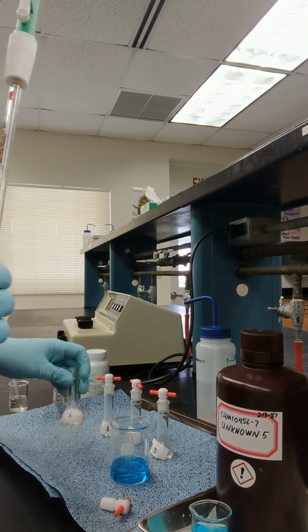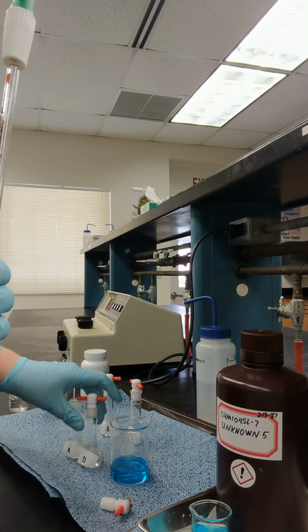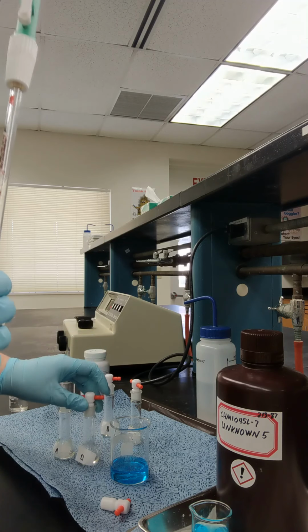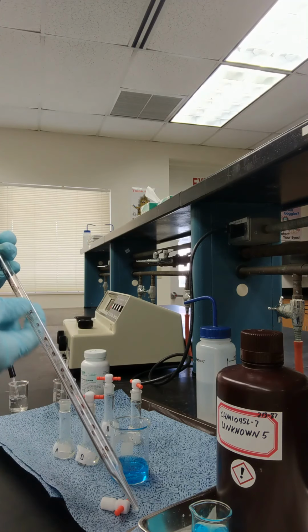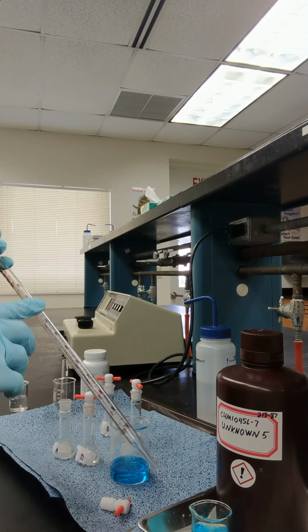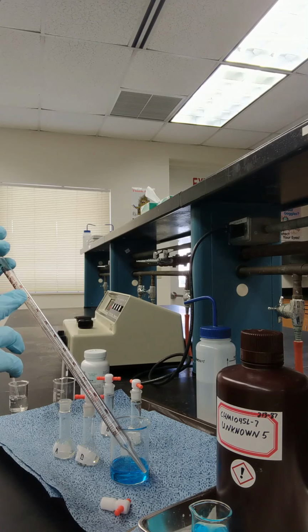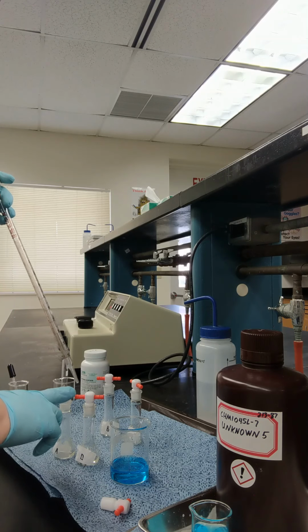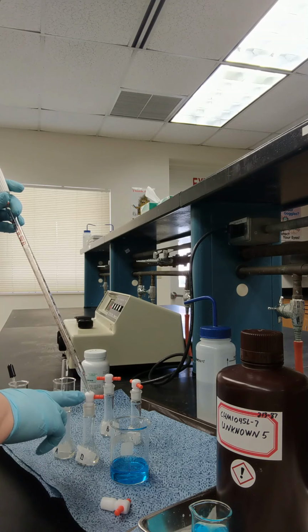So if I do standard A and standard D, that will be a total of 10 milliliters, 2 and 8. I'm going to fill this one all the way to 0 to have my 10 milliliters here. And then of those 10, I'm going to transfer 2 for standard A and 8 for standard D.